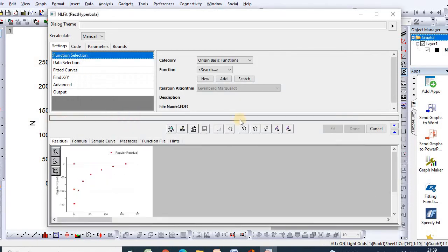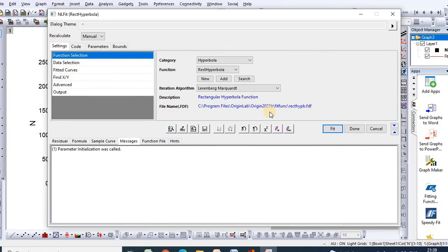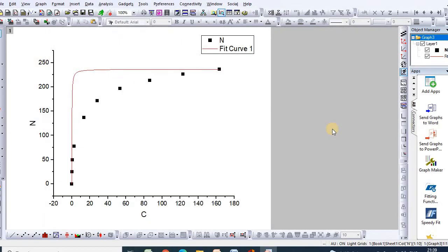Double-click the rectangular hyperbola function and your data will be fit to the Langmuir equation. Then click Fit. The data is now being fitted with the Langmuir equation.